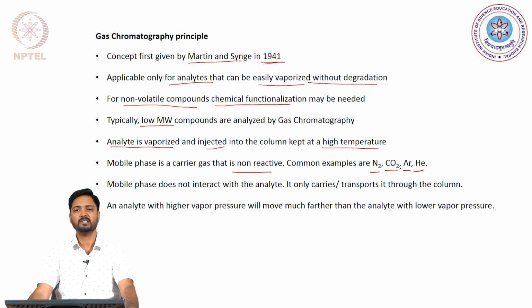Their essential role is to push the analyte through the chromatographic system, and during this process the separation of the analyte from the impurities or other analytes happens.